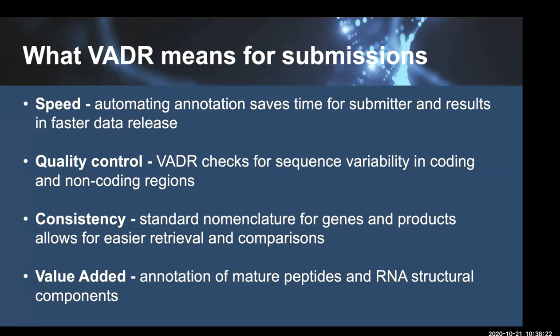Hi, this is Pavitra again from the University of Washington. Again, I also missed the first part, so apologies if this was covered. But for those who are submitting via the web, the web submit.ncbi, is it at all possible to have some sort of machine readable output format for that rather than an HTML report so that we can subset sequences and stuff?